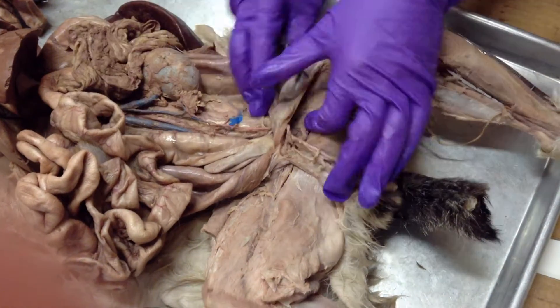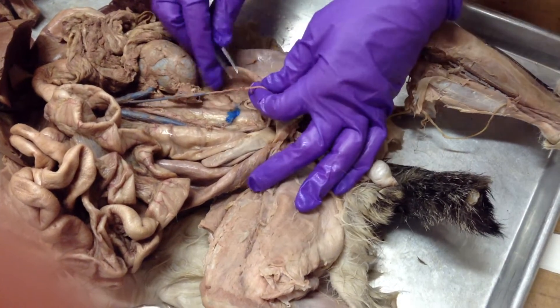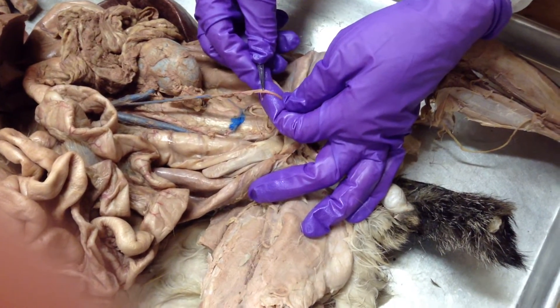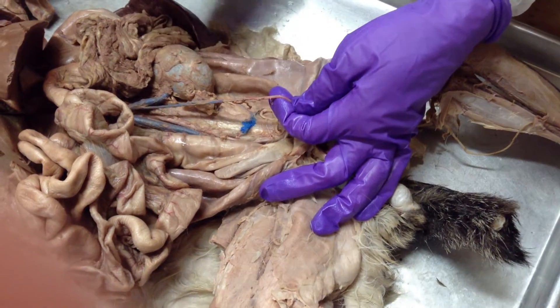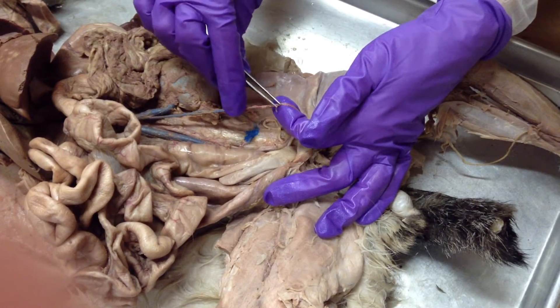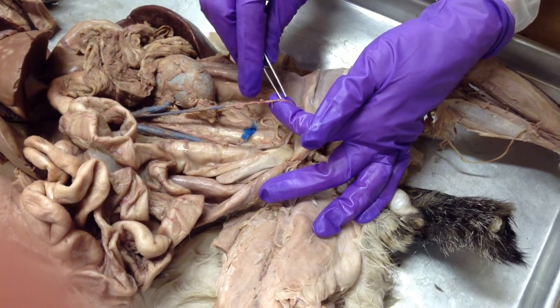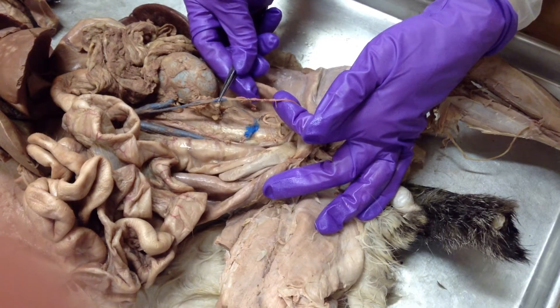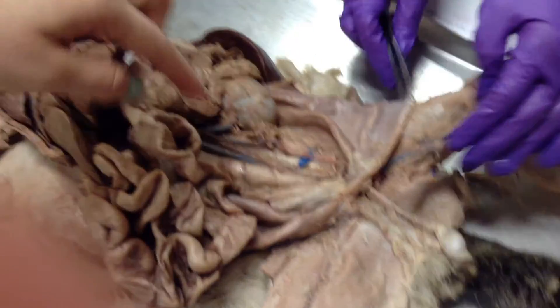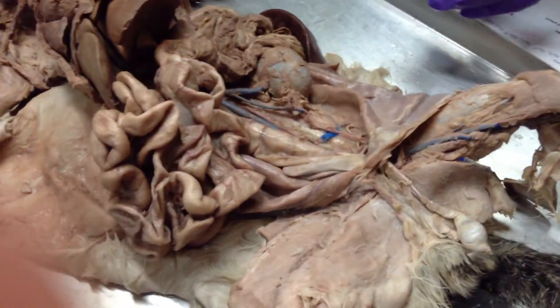In this cat the vas deferens is hard to see because it's not as white, but it looks like the white part next to the red. In other cats it's very white and kind of looks like floss. The red is the spermatic artery and the blue is the spermatic vein. The white is the vas deferens.